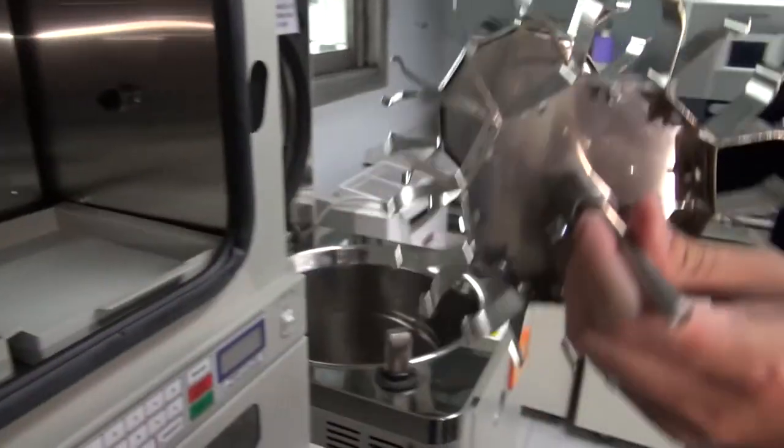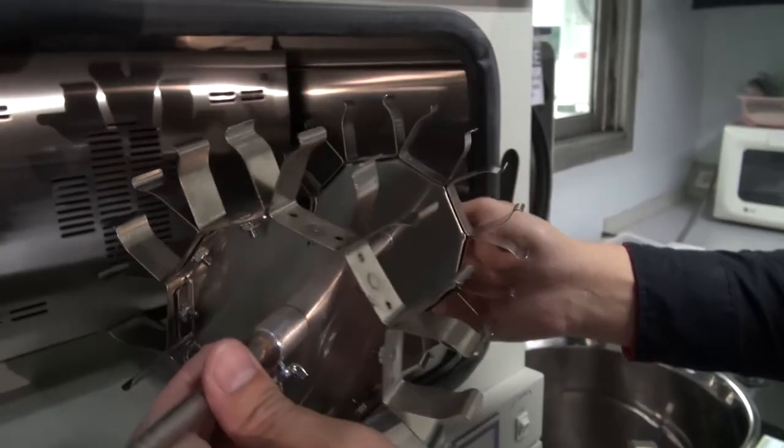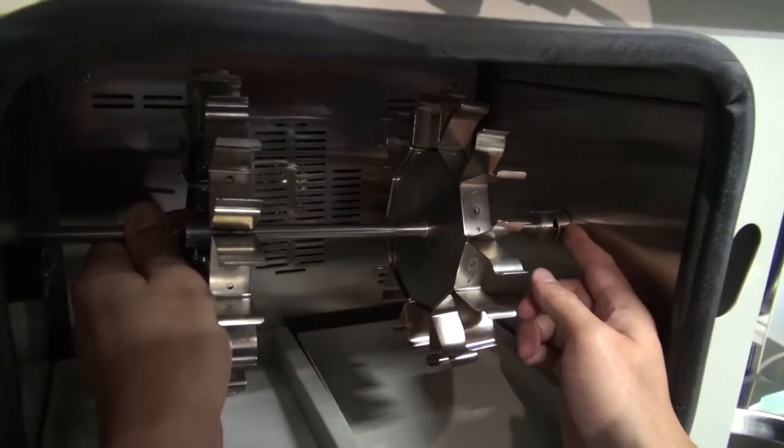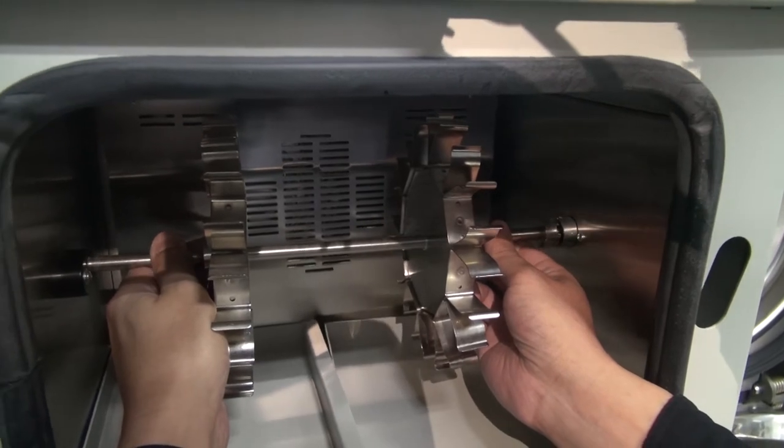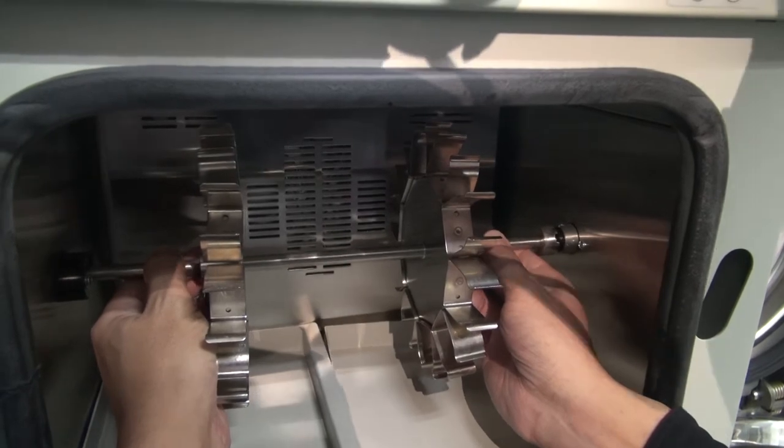To insert the carousel assembly into the unit, press the right shaft to the position and then insert the left shaft to the position until the click sound is heard.